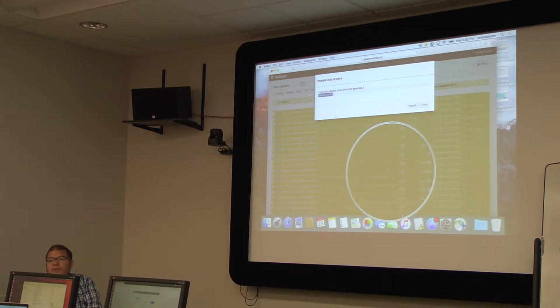Is everyone doing the same thing? Is everyone lost? It will be kind of slow because there are like 20 of us doing it at the same time. My one's already done. With the class and type again? What? With the class and type that we use. Class type? Model class and model. Oh, you'll see in the menu. We're going to do a full vesicle, a full classic model. Yeah, we're just importing the images into the history. Which images did you do? 3D, but which ones? All? Lamp. Yeah, lamp 2.